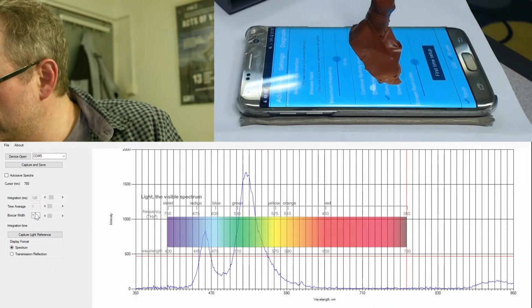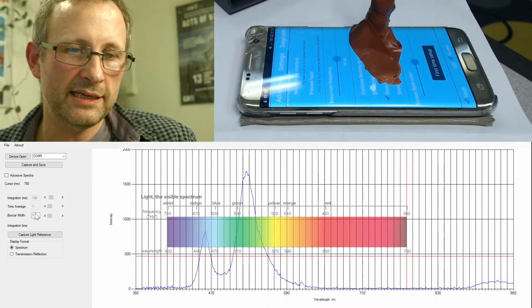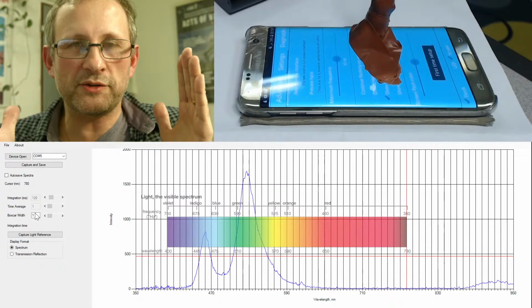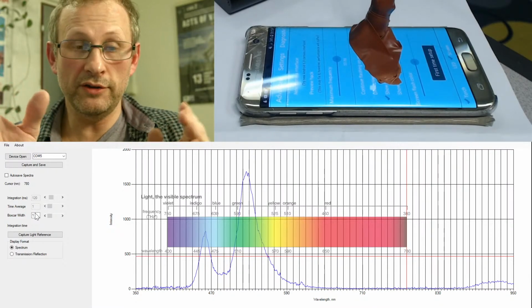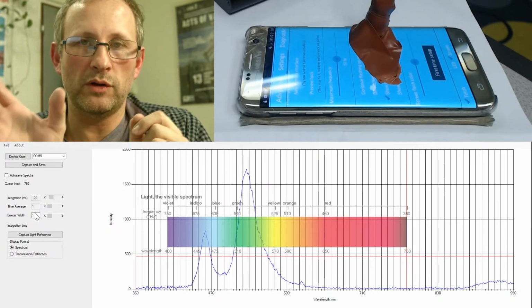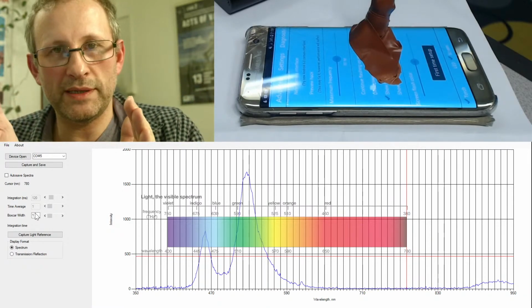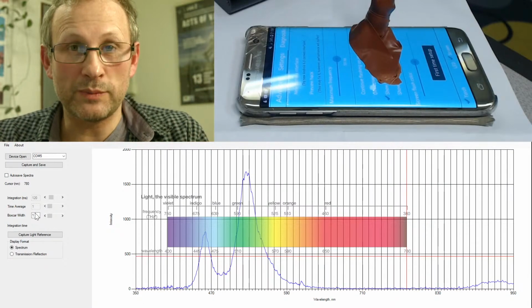Okay, can it use different sensors for full spectrum analysis? I need to see it all. Well, the reality is that spectrum analyzers like this, the broader the spectrum you want to look at, the less definition you often get. And if you look at some of the more expensive devices, which are not necessarily better than this, by the way, they tend to shift one way or other and have a smaller spectrum. So in answer to your question, if you want good quality data and you want a wider look, so more down into the UV and more up into the far infrared, you're going to have multiple devices, and there are people that sell these multiple devices.